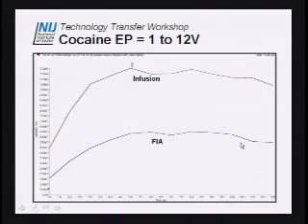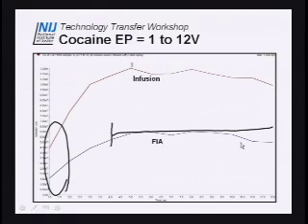And you can see here that both in infusion and FIA, it's pretty flat from this point forward. So you can see down here it makes a difference. If you have very low voltages down here, let's say less than 2, you're cutting your sensitivity. But after about 3 or 4, it's pretty flat. So setting it to 10 here is about the same as setting it to 5.